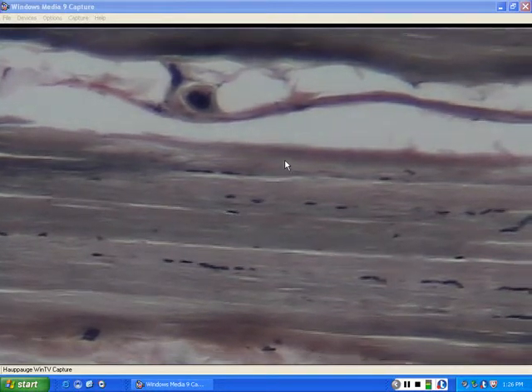One thing, though, you will note is when you look at each individual cell, they have more than one nucleus. The skeletal muscle itself is known as being multinucleated or syncytial, and has more than one nucleus in each individual muscle fiber. In order to see this better, we need to zoom in. And as we zoom in on this highest magnification, we will start seeing the structures that tell us that this is a skeletal muscle.